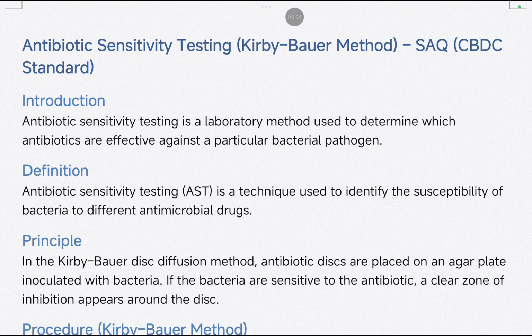Suppose some patient comes to you with an infection. Generally, most of the cases are of bacterial infection only. So how would you determine which antibiotic you need to give to him which will work best on him? If we give the right antibiotic to which the bacterial pathogen is sensitive, sensitive simply means that its growth declines, then the patient would be able to recover very fast.